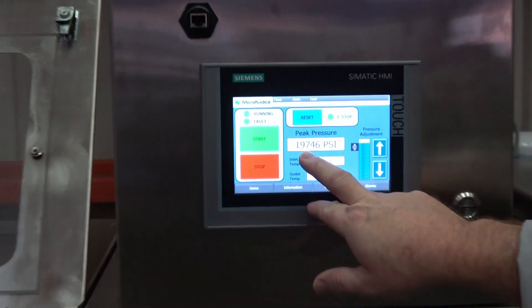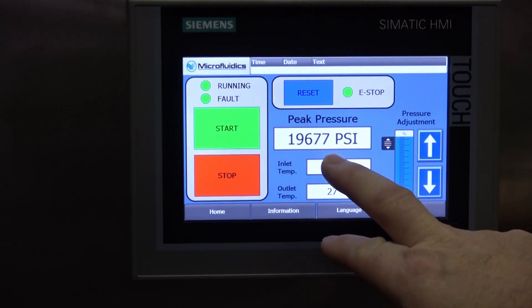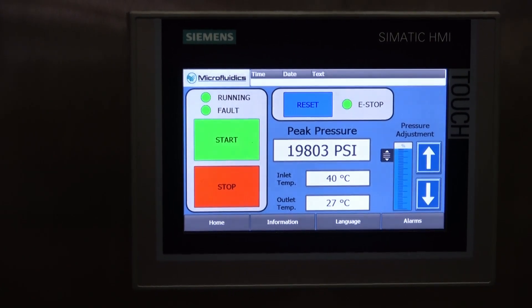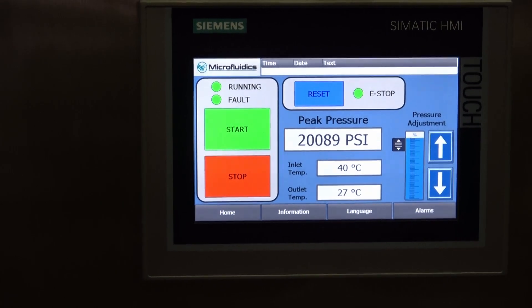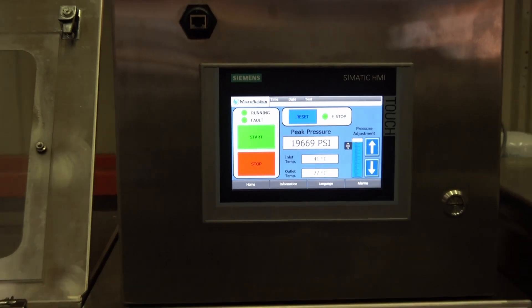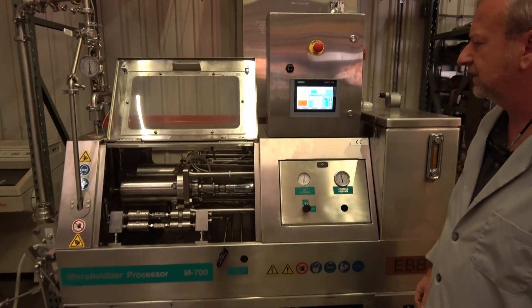Up here on the pressure gauge you can see how consistent the pressure stays. On a normal machine with only one cylinder — like their other models — you get major pressure drops while the cylinder is retracting. That's the advantage of the dual cylinder: essentially double the flow, not quite double, but a lot more flow and a lot more capacity.